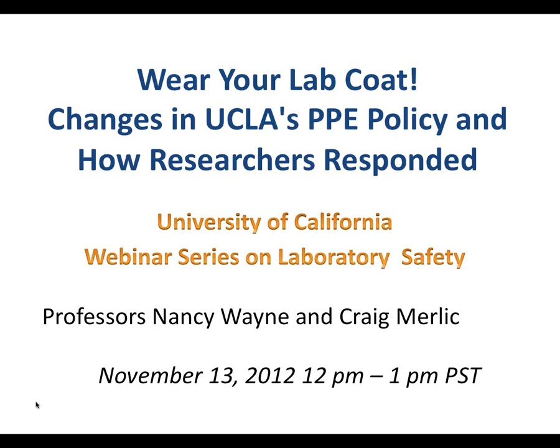And then one last question here is, is UCLA pursuing any way to tie compliance of laboratory safety into a performance evaluation of a principal investigator? Well, we've discussed it. It's not something that has been implemented. So I do it in my laboratory, but it was a way of getting people to be compliant more readily, long-time researchers who were having a hard time shifting their behavior. I think it's actually a really good tool to use for PIs, but it's not a policy.